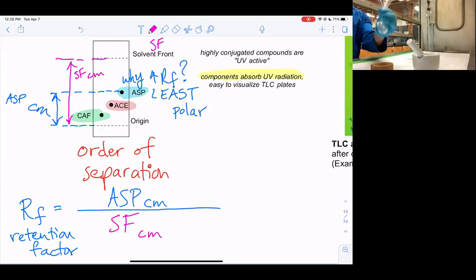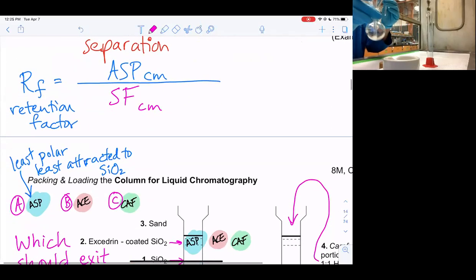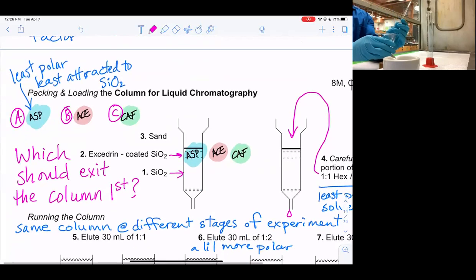Take it away, Victor. All right, so I have mixed everything together. Everything should be dissolved in the ethyl acetate, except for the insoluble components that are in the pill. So now I take my nice little mortar and pestle. Actually, what helps is having a stir rod here. So I have a nice little round bottom with a funnel, and then you can pour onto the mortar and pestle. That way it doesn't spill.